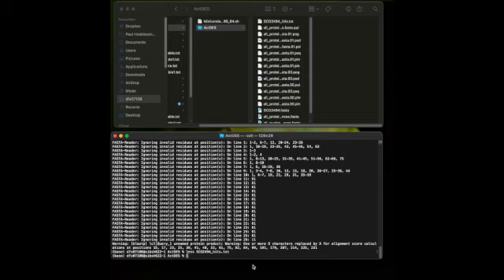Okay, so we can call this sort, and then we can give an output file name, which would be your SCO2494_hits.txt. Okay, so it's going to sort the file that you generated from your BLAST.